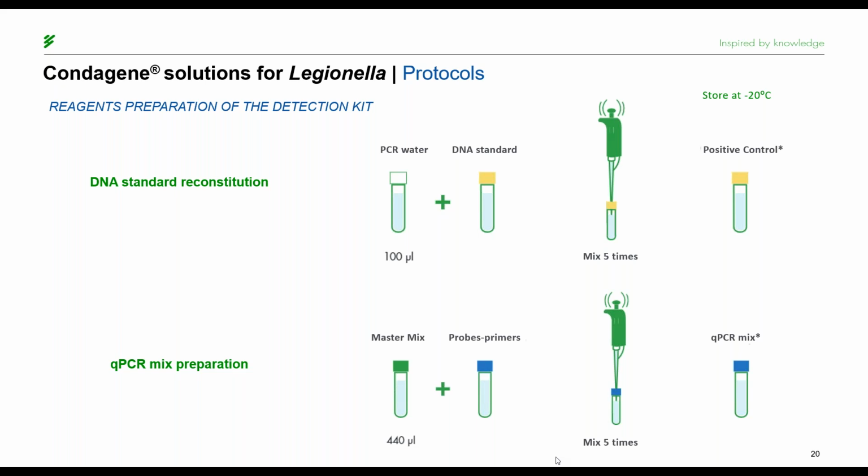We recommend allocating both reagents into tubes depending on the needs of each laboratory, since once ready to use, both reagents must be kept frozen at -20 degrees Celsius. To speed up the work in the lab, of course, make it easier, more comfortable, but also because there are limited freeze-thaw cycles of these reagents, and if exceeded, their correct functioning would be compromised. We have done stability studies on this. Of course, before each use, we recommend to give them a spin once they are completely thawed.